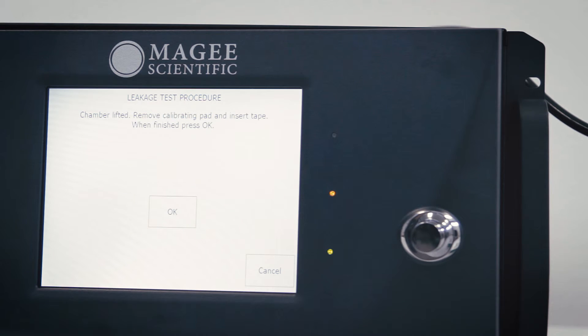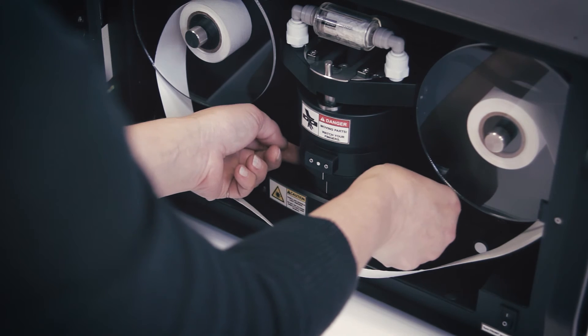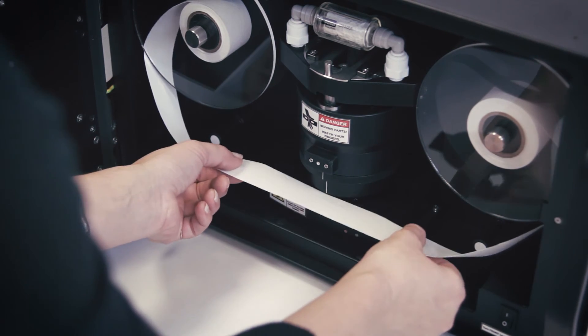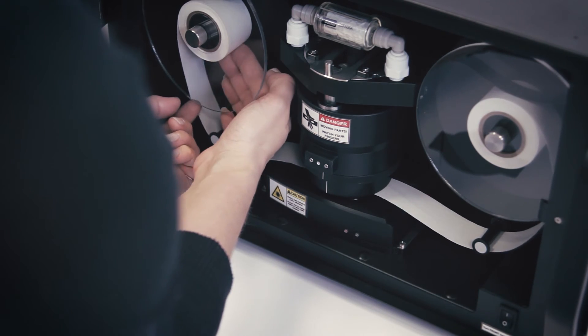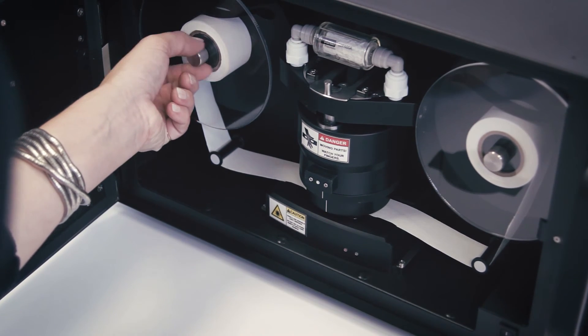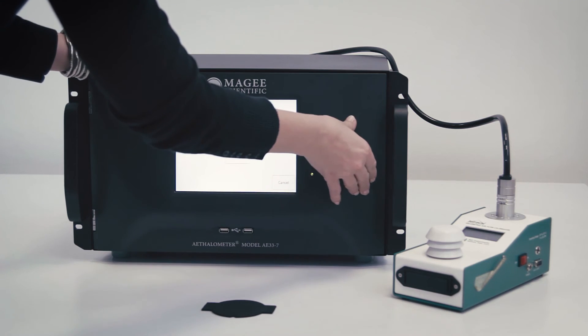When finished, remove the flow calibration pad and replace the filter tape. Press OK when done.